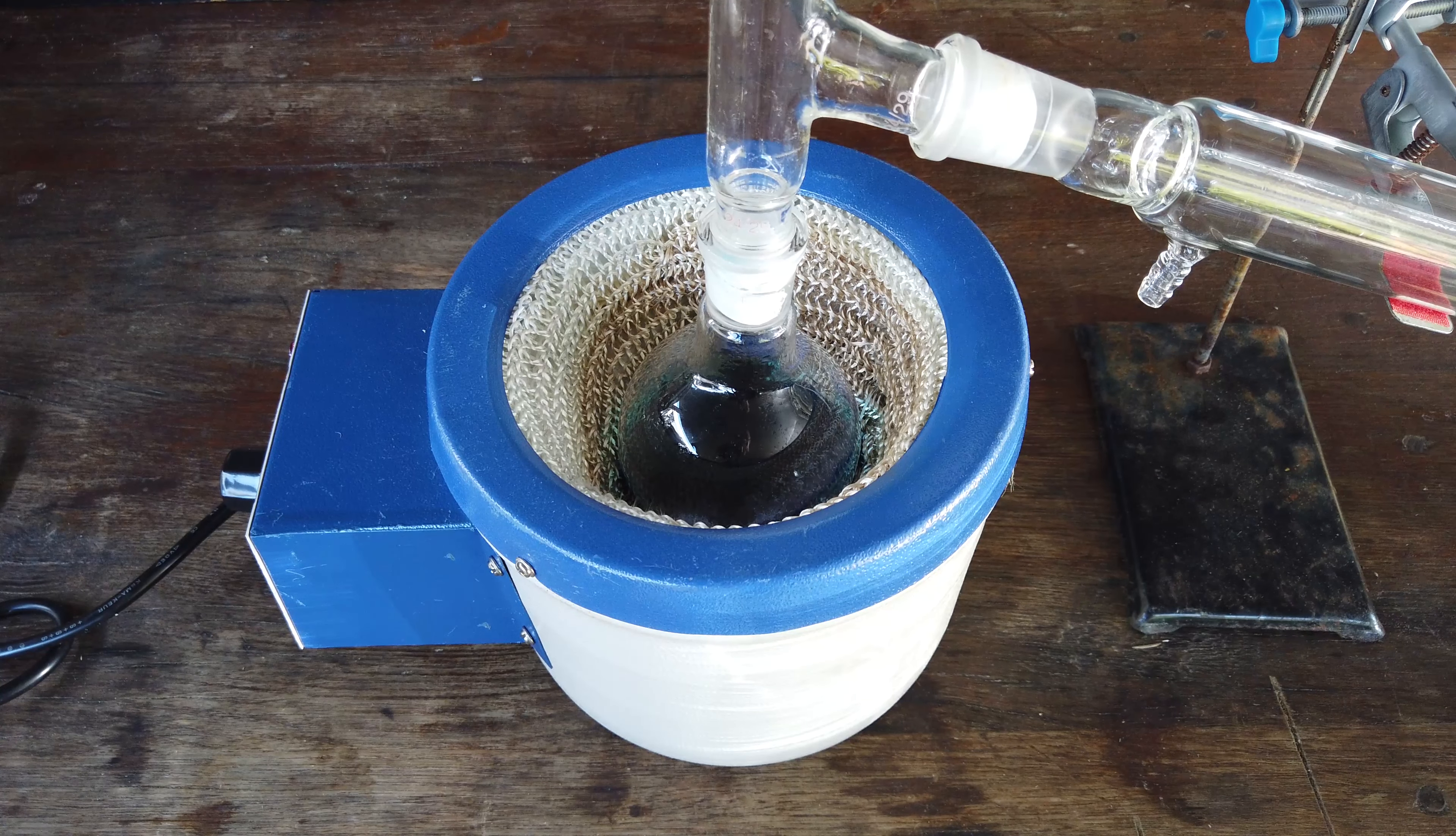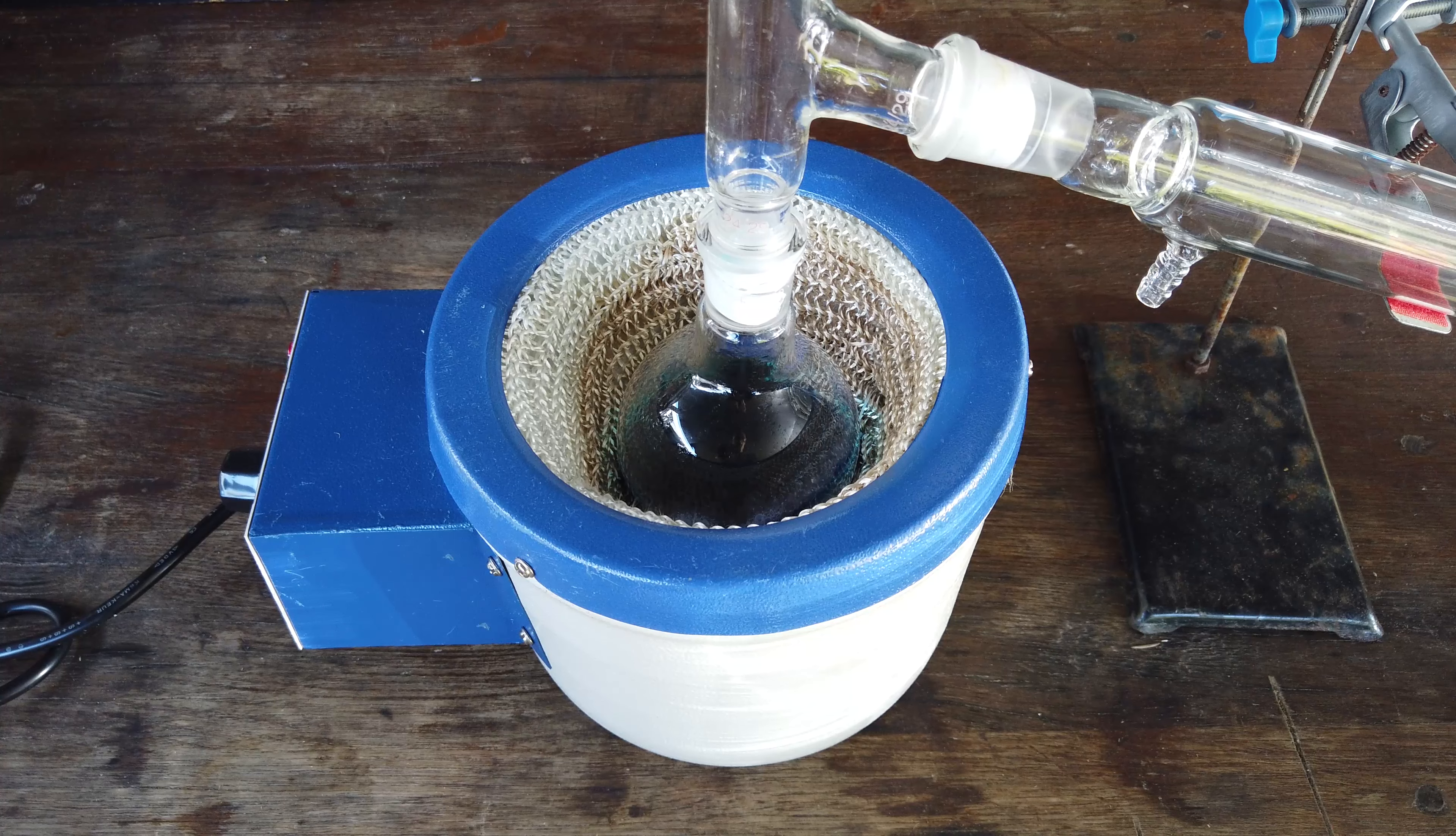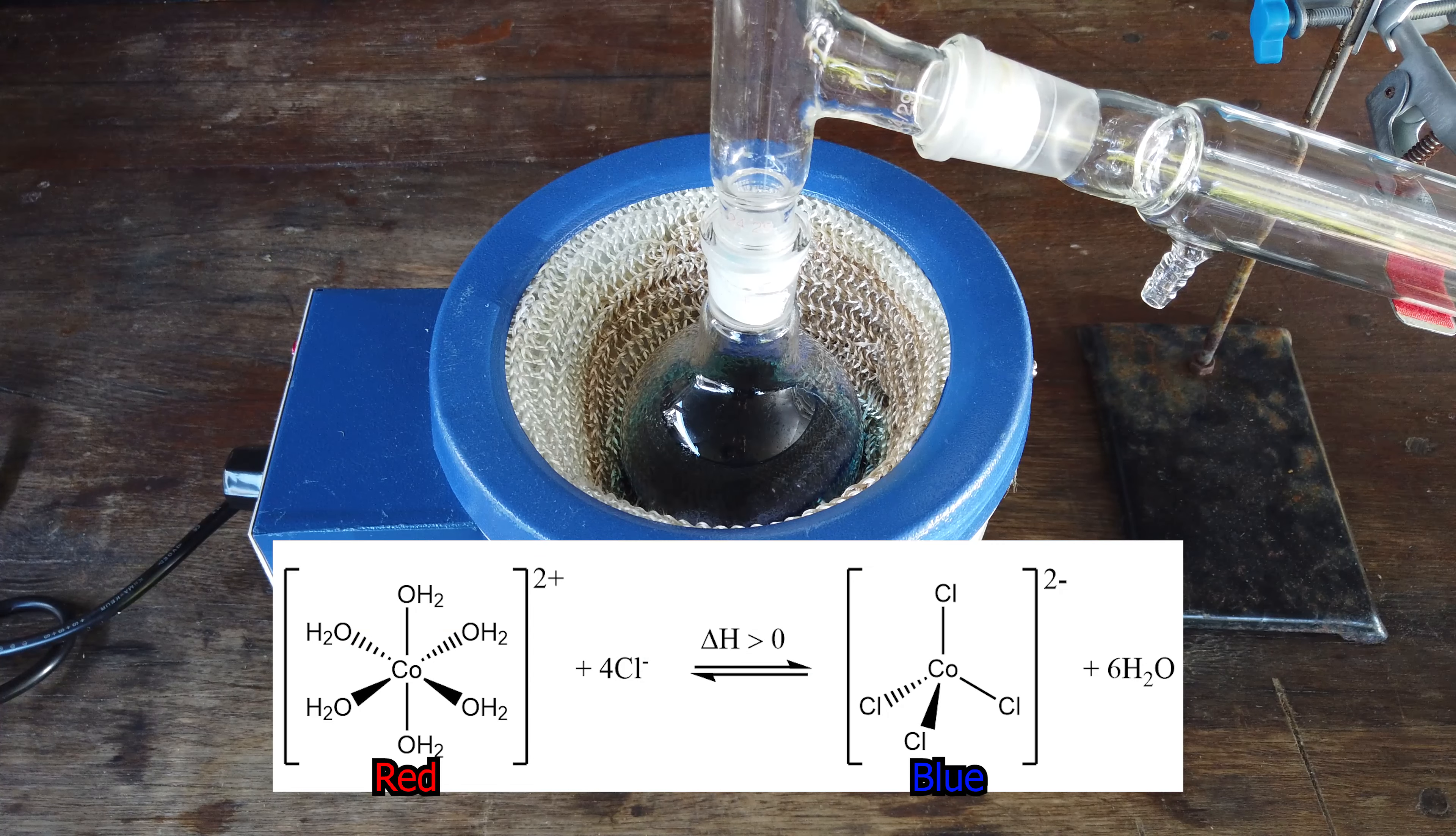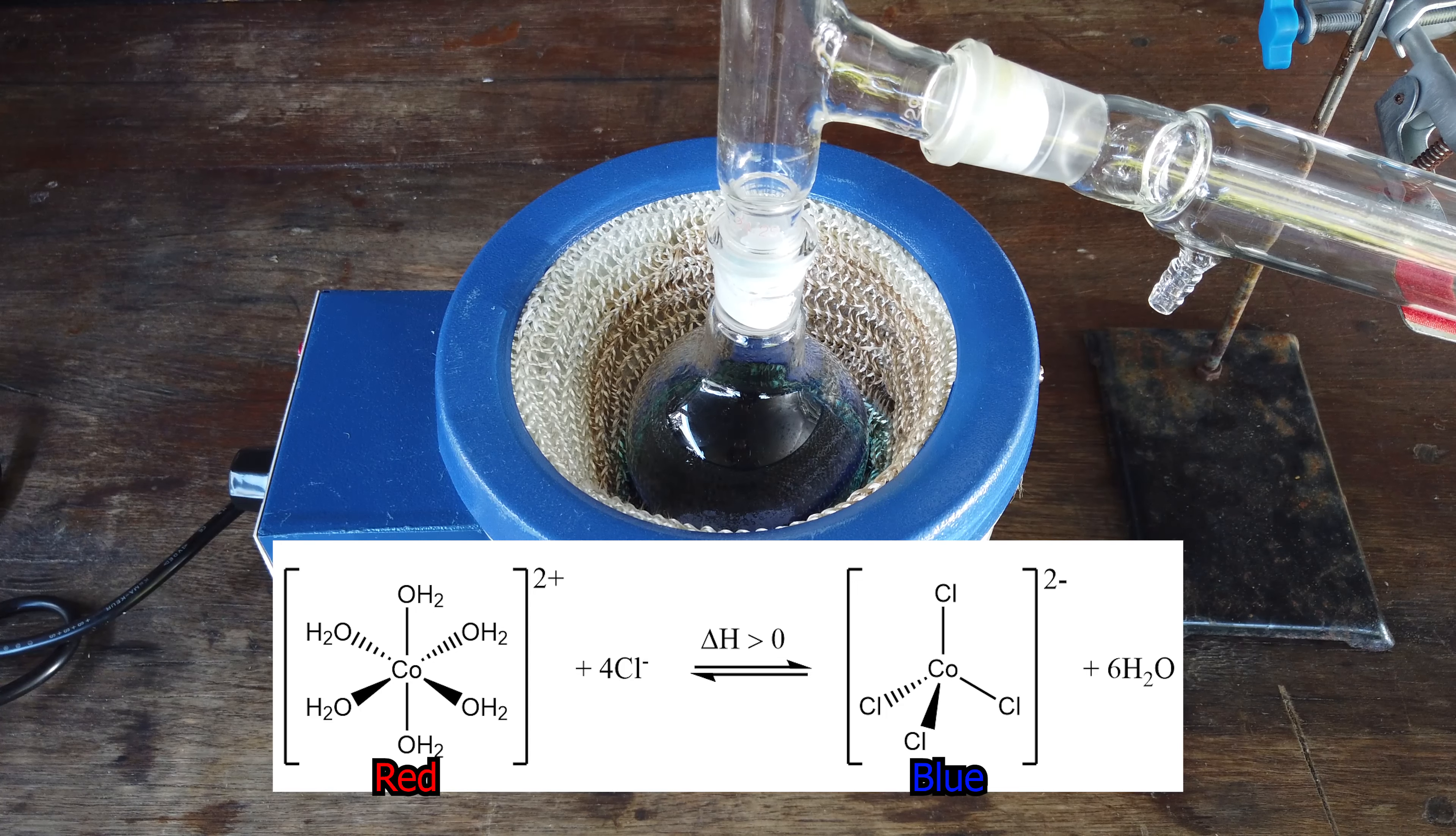Now that distillation has started, one cool thing about cobalt chloride: if you heat up a solution with excess chloride ions, the solution completely changes color. We have now a very blue solution instead of that purplish pink. The reason is cobalt with chloride ions can form a tetrachlorido-cobalt complex, and formation of this complex is favored at high temperatures, whereas the cobalt remains in the hexa-aqua complex state at room temperature.